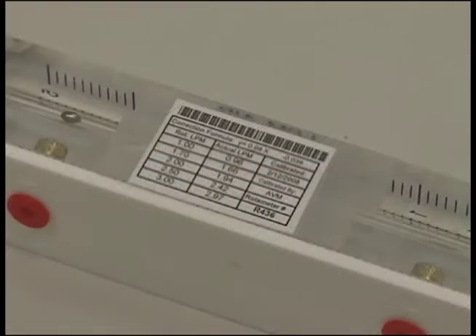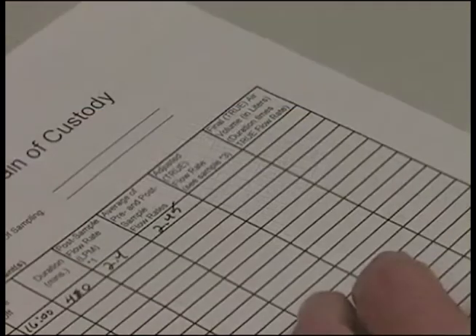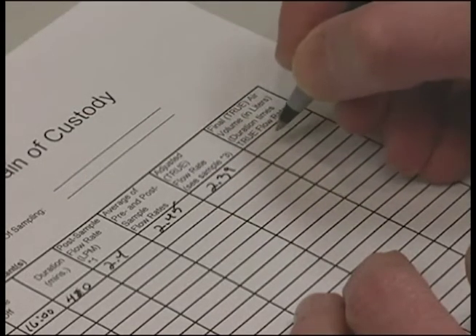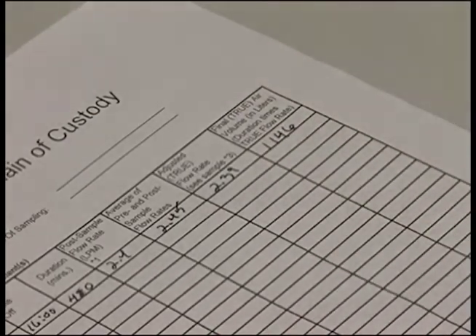All rotometers are calibrated against a primary standard quarterly. This calibration formula is located on the side of the field rotometer. Take the average rotometer reading and plug it into the calibration formula found on the side of the rotometer to determine your actual flow rate. Multiply the flow rate in LPM by the total time sampled in minutes to get the air volume in liters. Record the total liters on the field data sheets and the chain of custody.